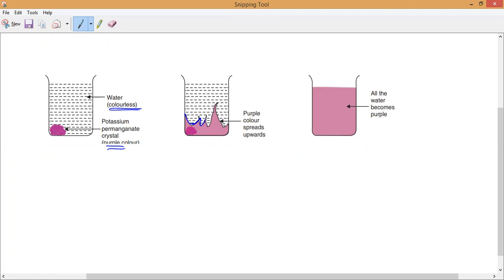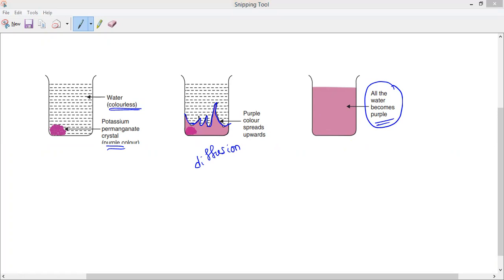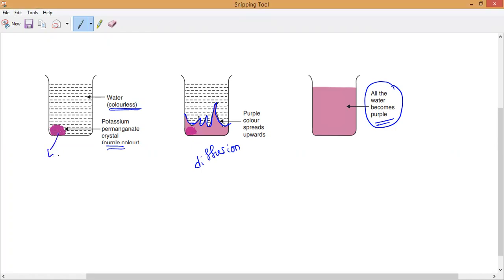I kept the potassium permanganate in only one corner of the beaker, but after some time the purple color starts spreading upward. This process — moving from high concentration to low concentration — is called diffusion. Once you leave it undisturbed, the complete water turns into purple color. This is what we study as the dissolving of potassium permanganate in water.